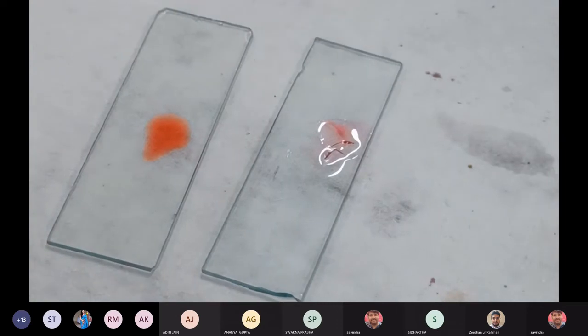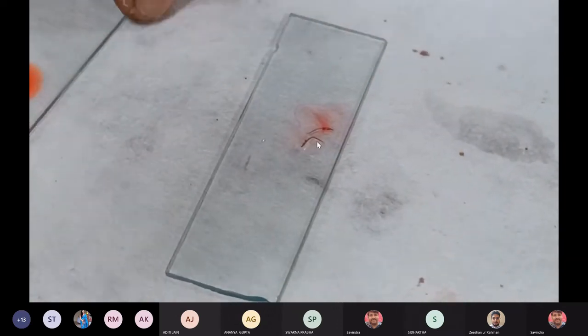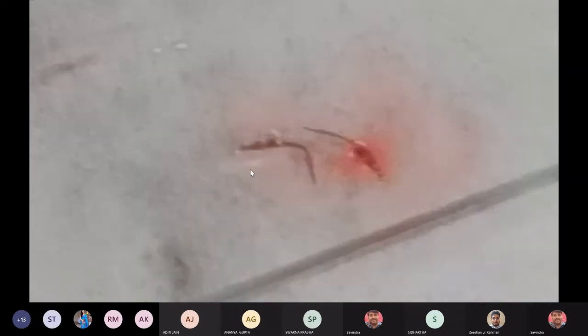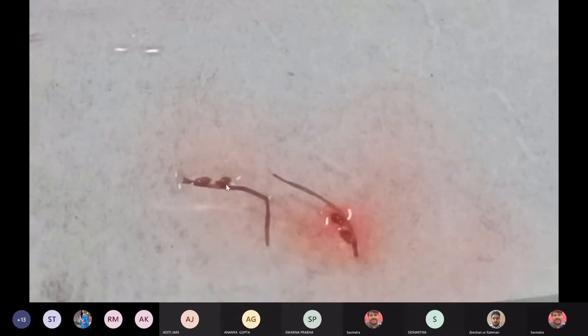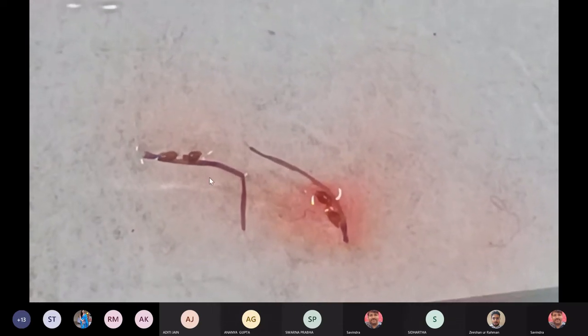While using a needle, you should take extra care, because now you can see those dot structures on these threads. Can you see these? Yes, sir. दिख रही है dot structure? These are the sex organs of Chara. दिख रहा है आपको यहाँ पे क्लियर? Yes, sir.